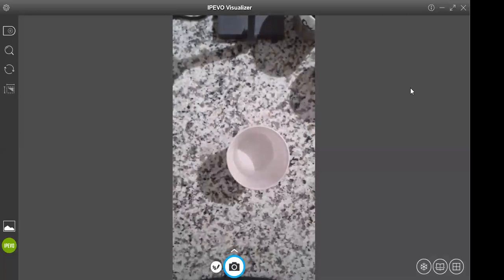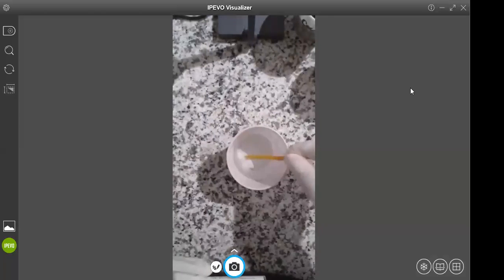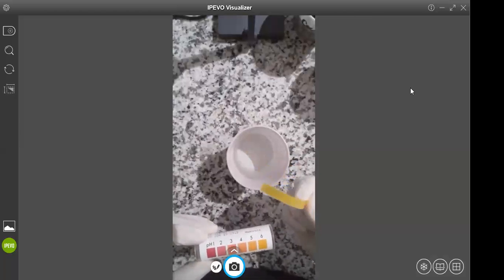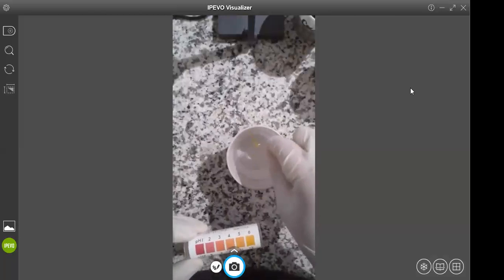Those of you thinking, this is kind of dumb, we already know the pH of water, well, it always helps to test it out too. We're going to take a pH strip and put it in the water and see what the pH of water is. Now, you can see the test strip did change color because the original color is a little orangey. If you notice, some parts of it are a little bit different colored from the rest of it.